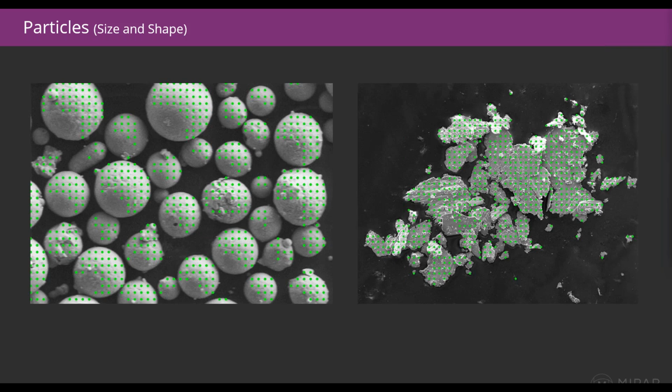Here we will combine some classical processing with our grid and say only put down grid points in the lighter parts of the image, which is where I know particles have a chance of being. Ignore the darker regions, which can prevent some dark pockets from being falsely detected, and of course greatly reduce the number of prompts that need to be processed, resulting in a much faster solution.